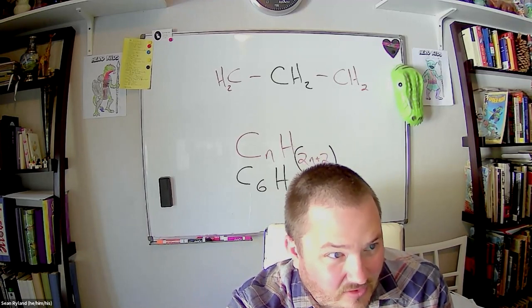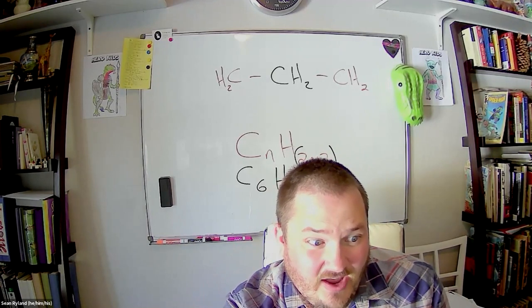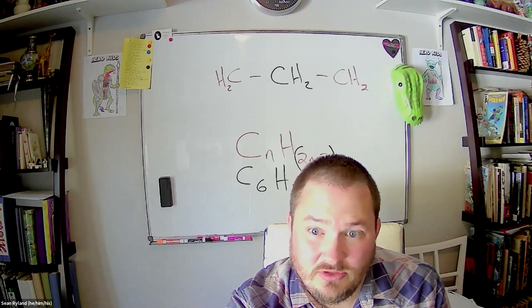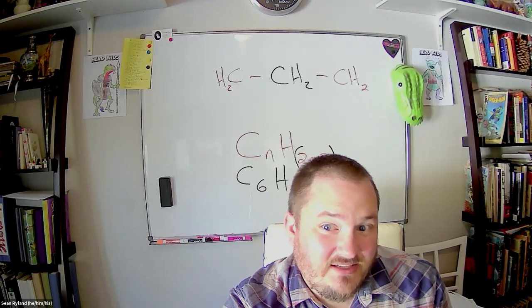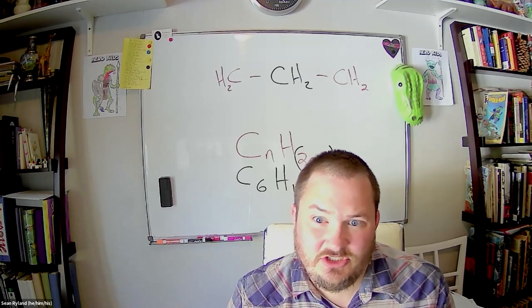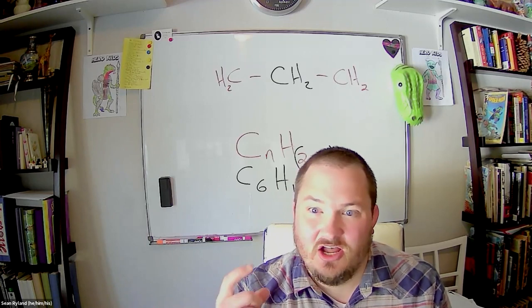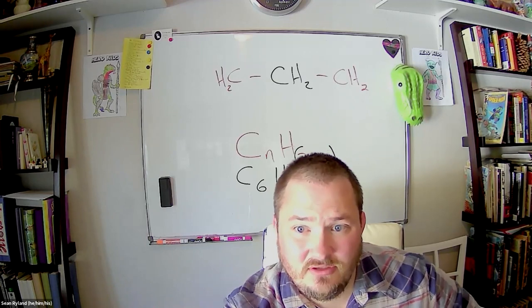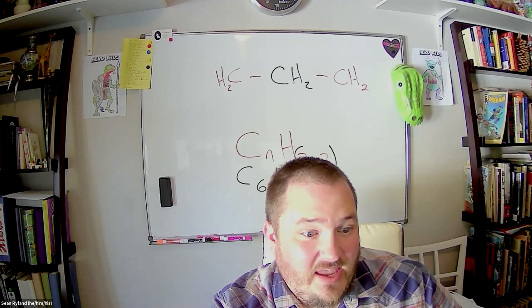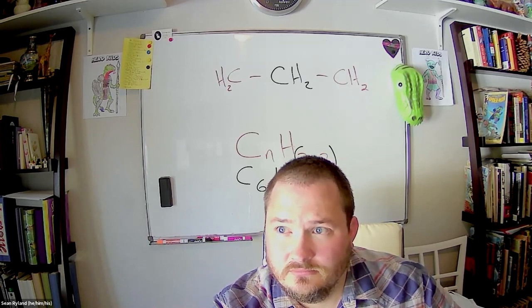I have not looked at the answer to this one, but if I had to guess, I'd say that's an alcohol proton. And that doesn't necessarily mean that there's no hydrogens attached to the carbon it's attached to, because alcohols behave differently, because carbon and oxygen are just not the same nucleus. And therefore, you can't trust the peak splitting.